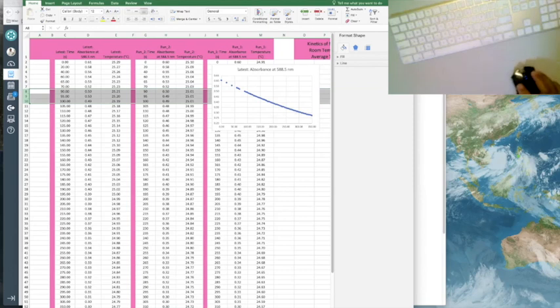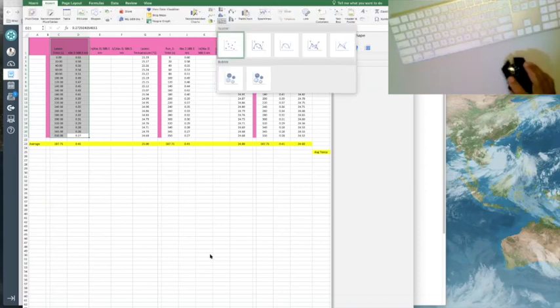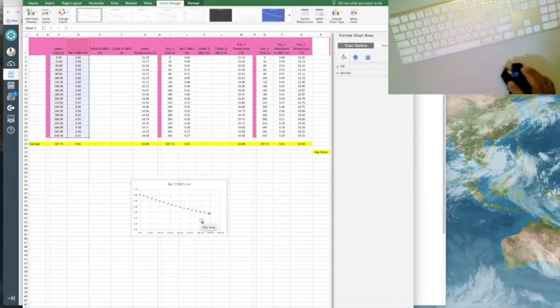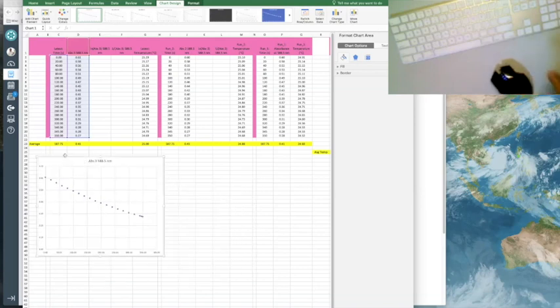And so eventually it'll look like this. Okay, you get down to 20 data sets. And let me just plot this so you guys can see what it looks like. You're thinning out the data set. So now it looks like that. Okay, it's not so continuous. The next thing you want to do after you thin out your data set, and 20 is a good number to thin it out to. So I went from 2 to about 21. So that's 19. That's good enough. Anything above 15, anything below 25 is good enough.